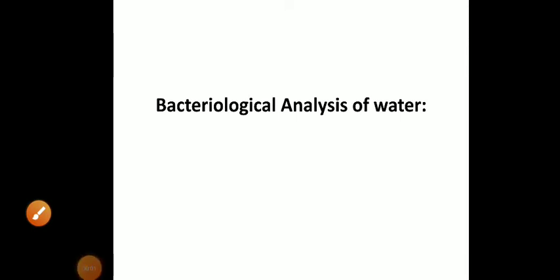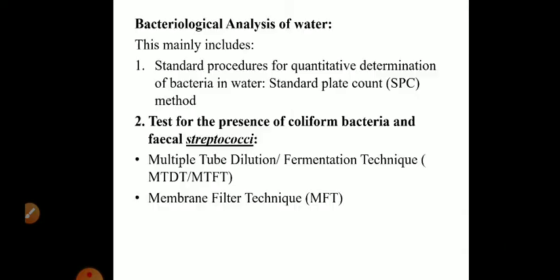Good afternoon, dear students. Now we are going to continue with bacteriological analysis of water. In the last lectures, I told you how a sample is collected and handled, and the different indicators of fecal pollution that we have discussed. Now today we are going to discuss various tests that are used for bacteriological analysis of water.